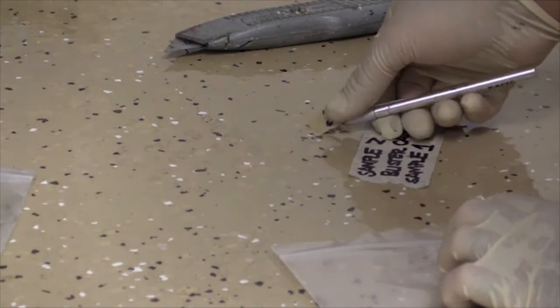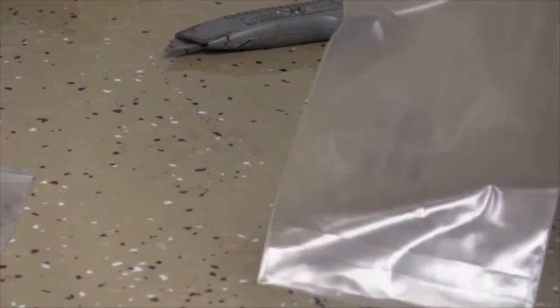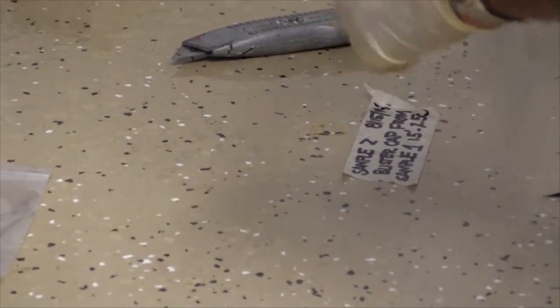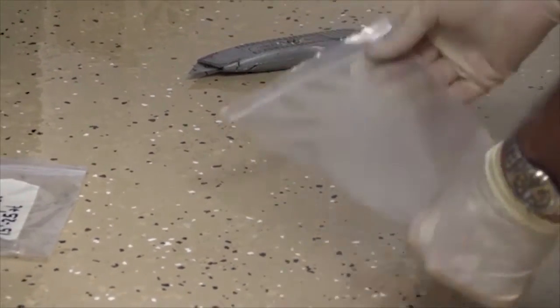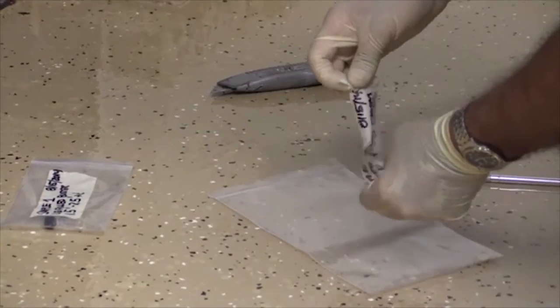So what I'm going to do is I'm going to take that sample, I'm going to put it directly into my sample bag, and seal it. Take my label from the floor, showing that this is sample two, and put it right on my bag.